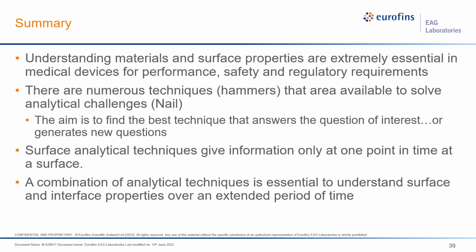In summary, understanding materials and surface properties is extremely essential in medical devices for performance, safety, and regulatory requirements. There are numerous techniques that are available to solve these analytical challenges. The aim is to find the best technique that answers the question of interest or generates new questions. Surface analytical techniques only give information at a point in time on the surface. A combination of analytical techniques is extremely essential in understanding the surfaces of interest over an extended period of time.